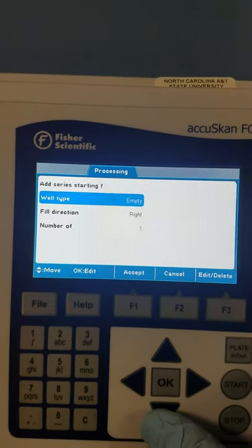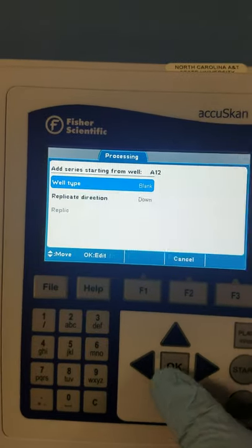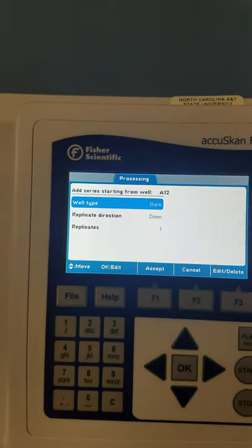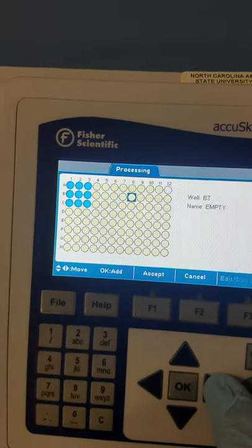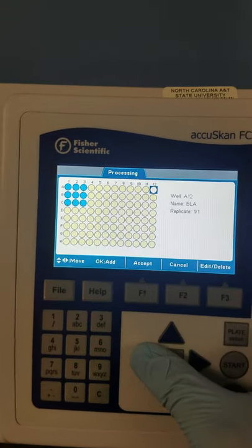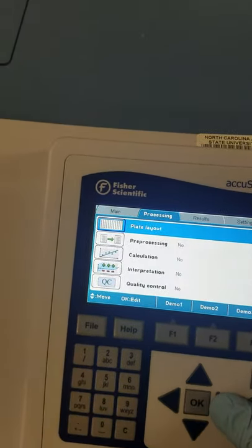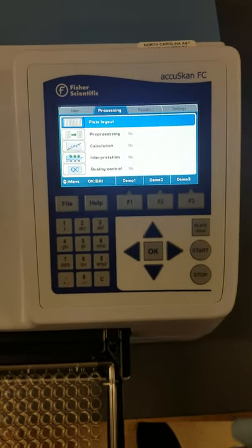But that's not all we have — we also have our blank. So what we are going to do is set this as our blank. We don't need any replicates or anything, and just hit Accept. You will see that it is white. So processing is good — that's all the manipulation we're going to do.